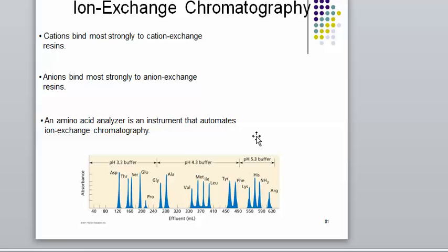It says that it turns things purple. And we can use this as a detection so that when we separate amino acids, they come out of the machine, they react with ninhydrin, they turn purple, and we can use a detector to kind of monitor that for us. And we can kind of see spikes of chromatograms, and then the height of the spike, of course, represents how much amino acid that you have in your sample.